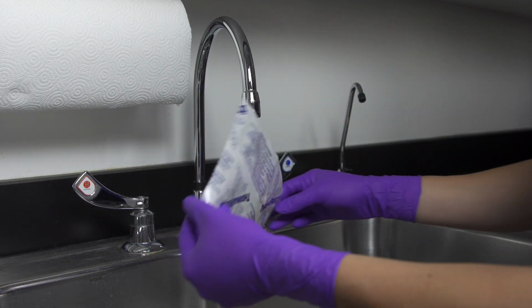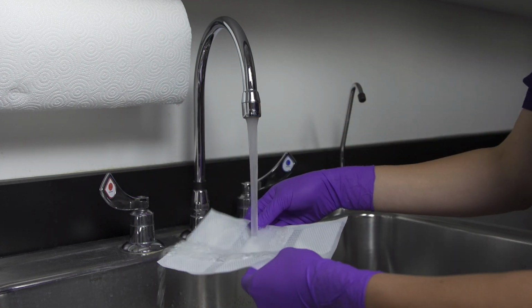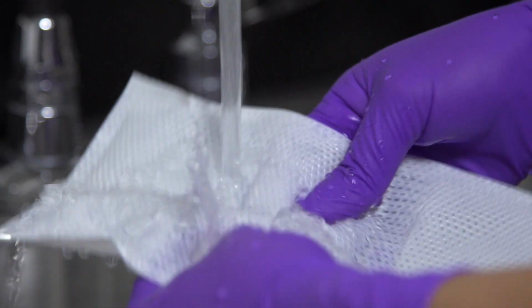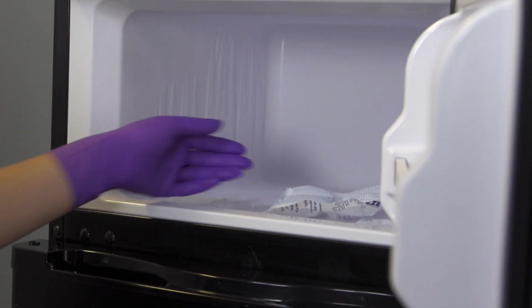The first and most important thing to do is rehydrate the ice packs. This can be done well in advance of sampling the water. To rehydrate the ice packs, run them under warm water and massage the cells until fully expanded. Place the expanded ice packs into the freezer for at least 5 hours prior to sampling.